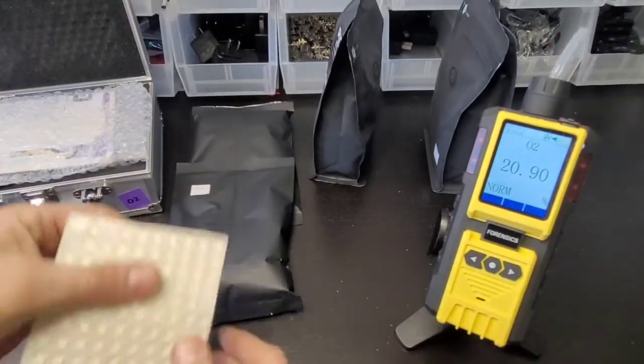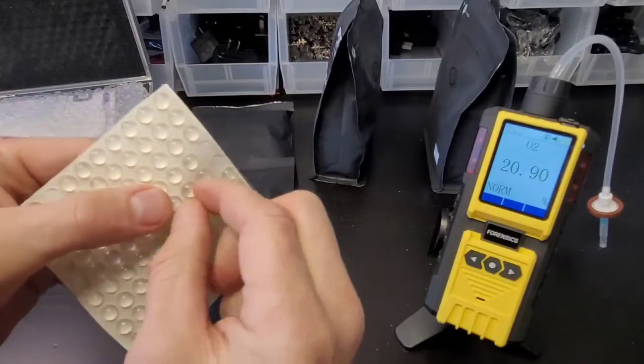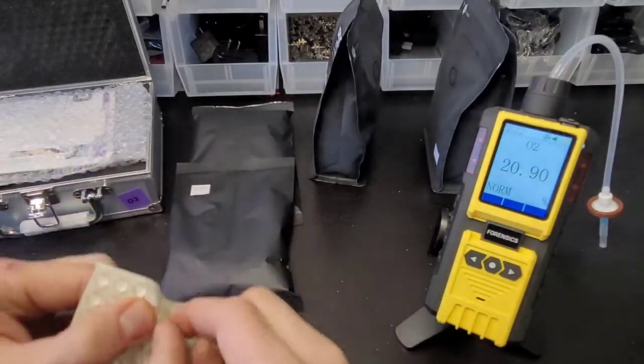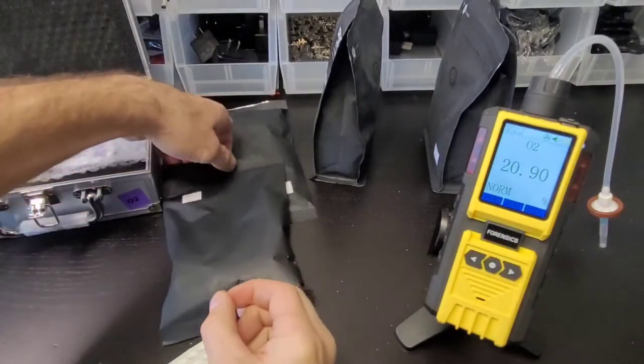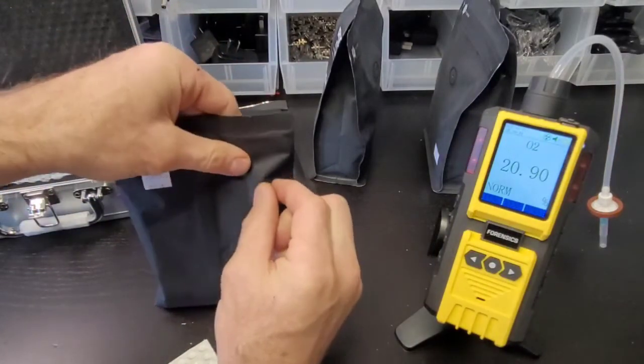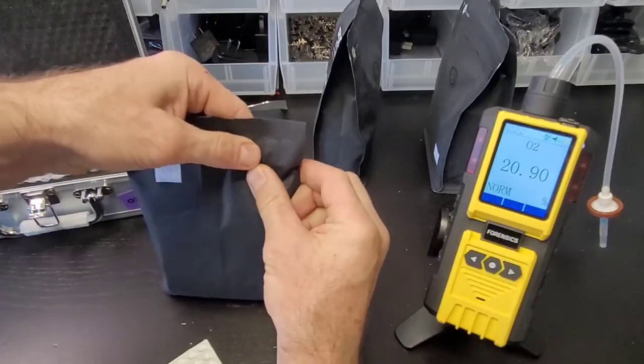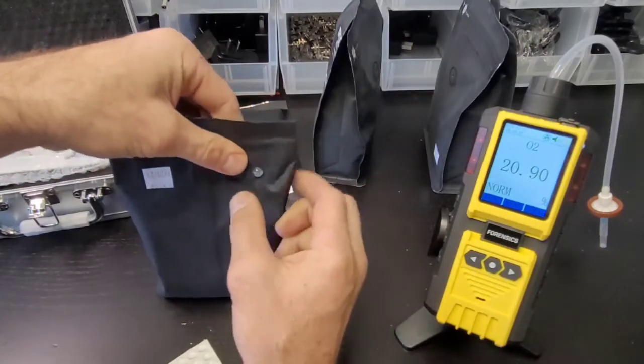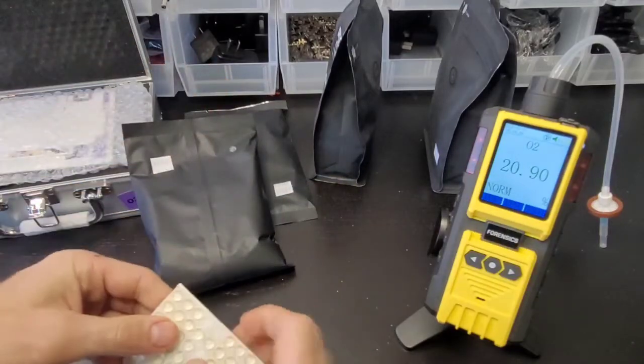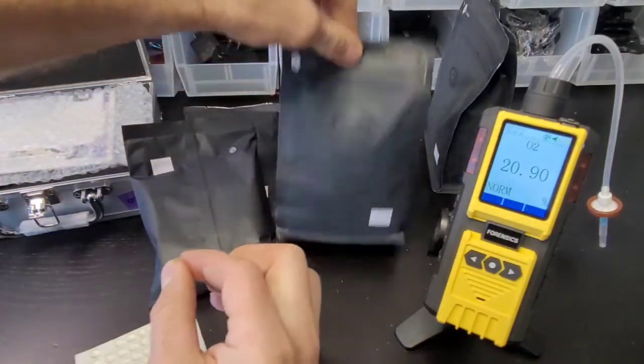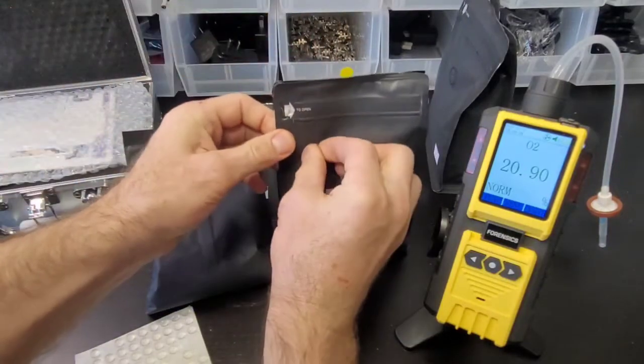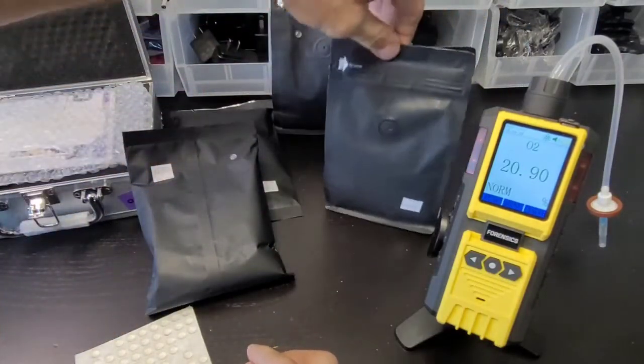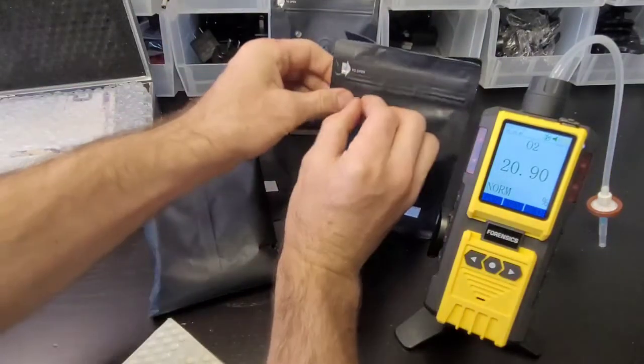These are septa - they're basically little rubber dots that are adhesive. We pop them on to the bags, the coffee bags. This is ground coffee from a special customer. Just stick them very nicely on the bags. I'm going to pop them on all these bags because we're going to be analyzing all of them.